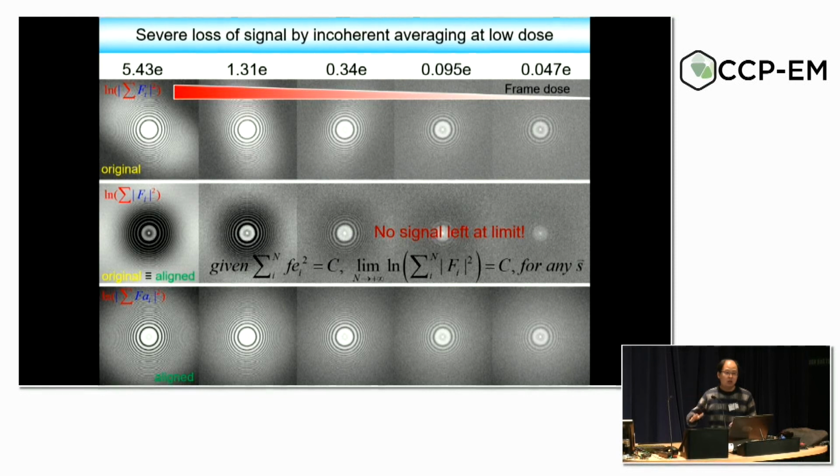And then you average all the frames. It will still be a constant function. So, considering it's a continuous function, when you get less and less dose, you will finally converge to a constant function, and the average is identical to the real space averaging, because the power in both real space and Fourier space must be the same.